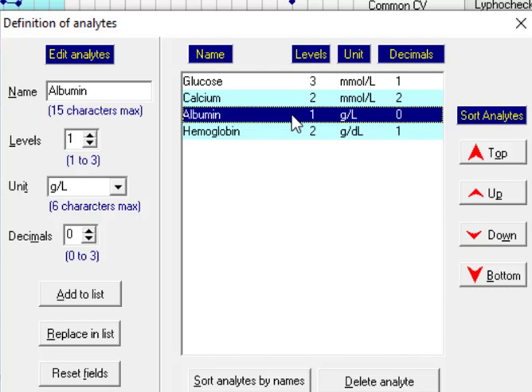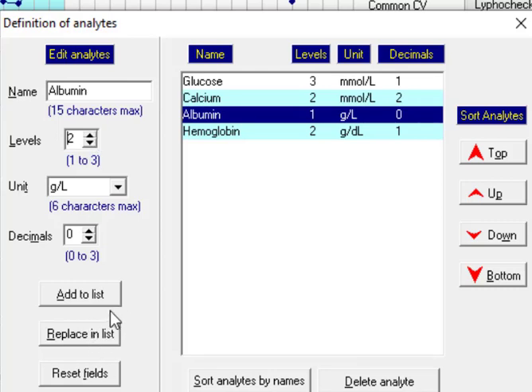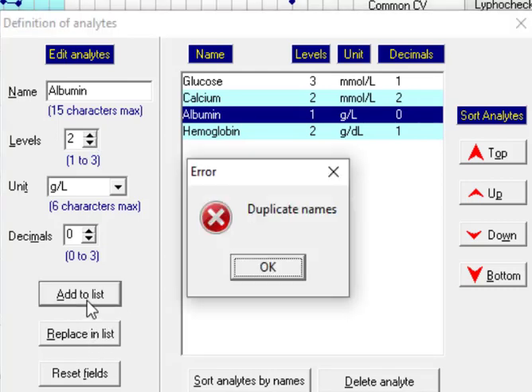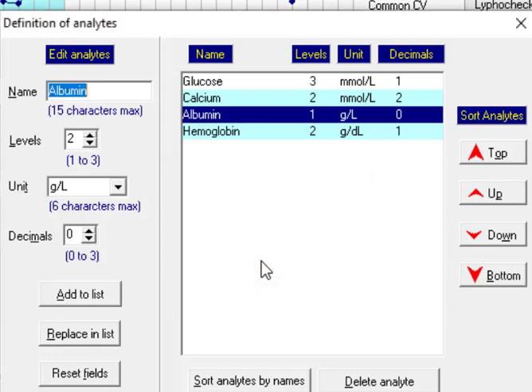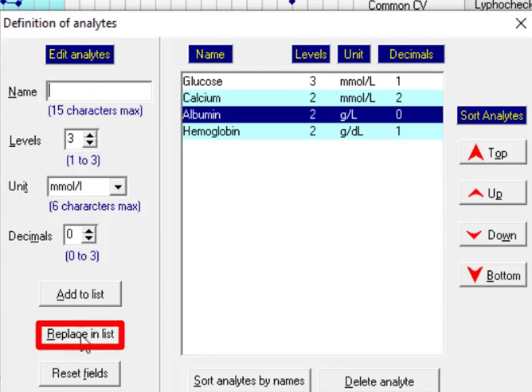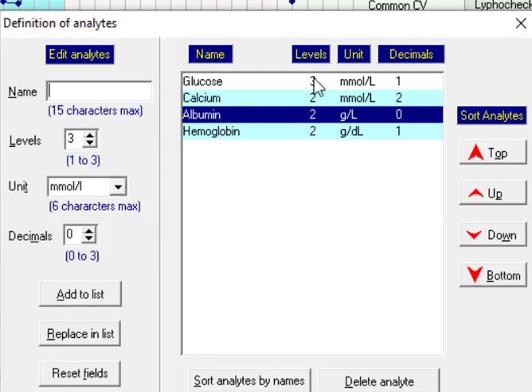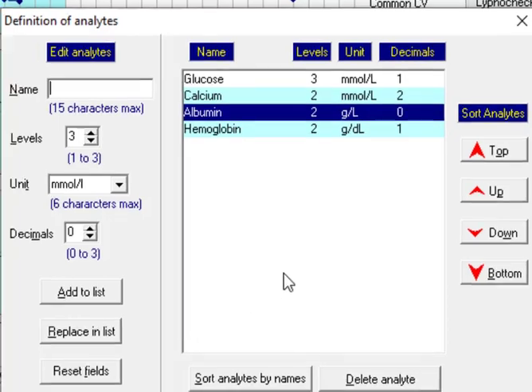For example we add one another level to this analyte and, oops, add to list is not possible because it is duplicate, it's been repeating. So what we can do is to replace in list and that's all. Albumin has been replaced by two levels this time.